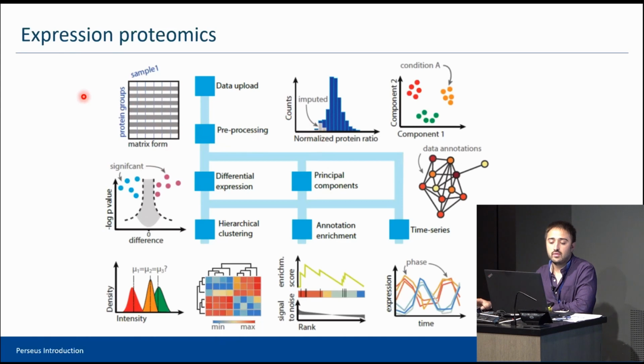And this will have, let's say, the LFQ intensities. Or if you are using it to analyze genomics data, it could be a counts matrix or whatever. But the important thing is that you have numbers that represent the intensity in the entries of the matrix, and then you have samples in the columns, and proteins in the rows, right?